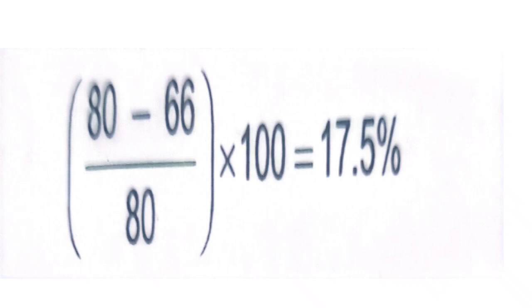Now, since oxygen is the active part of air, and we are saying phosphorus smolders in oxygen, then we expect this percentage to be about 20.9%. But it is not the case. Why? Because there are some errors which are usually incurred during the experiment.